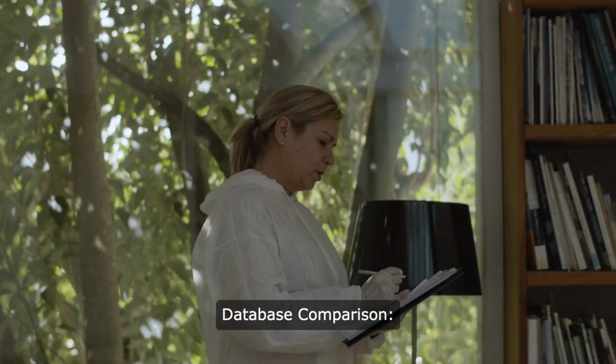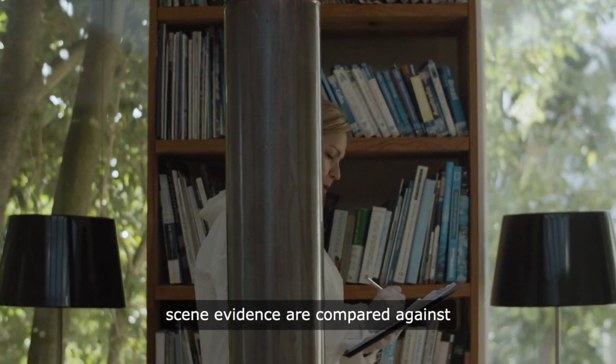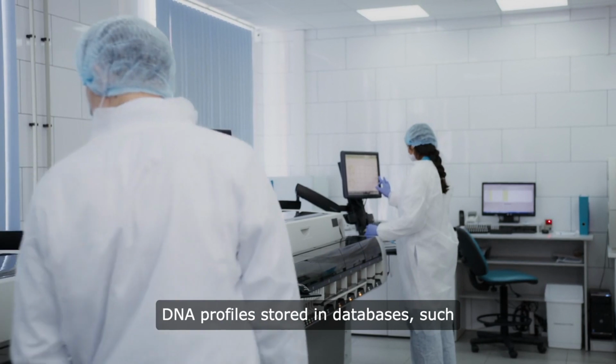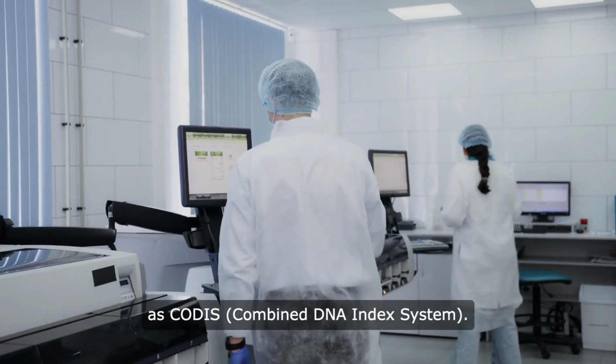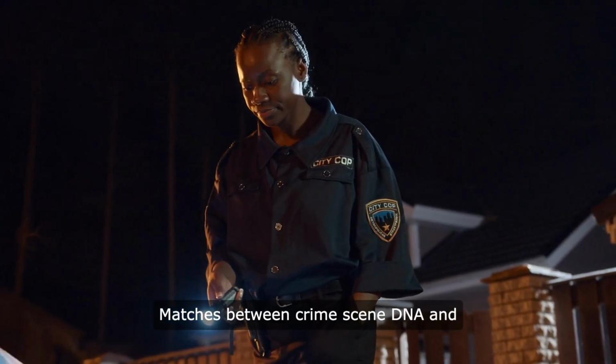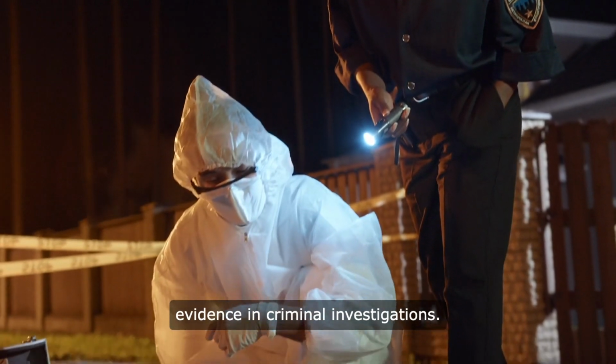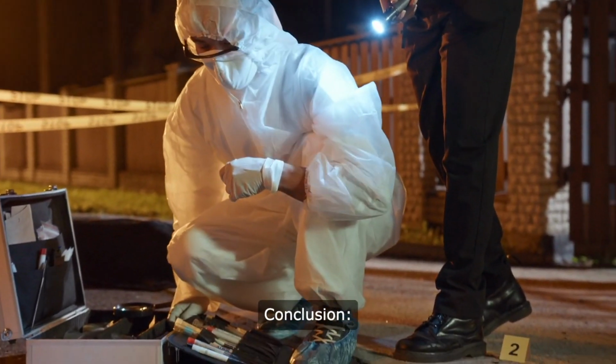Database comparison. DNA profiles obtained from crime scene evidence are compared against DNA profiles stored in databases, such as CODIS, Combined DNA Index System. Matches between crime scene DNA and known individuals can provide valuable evidence in criminal investigations.